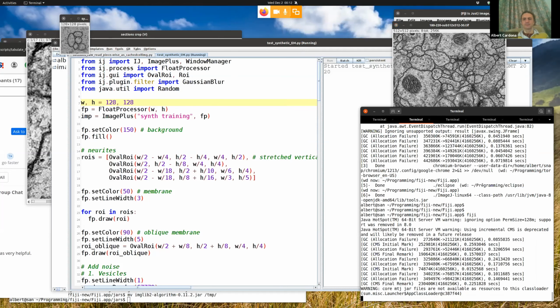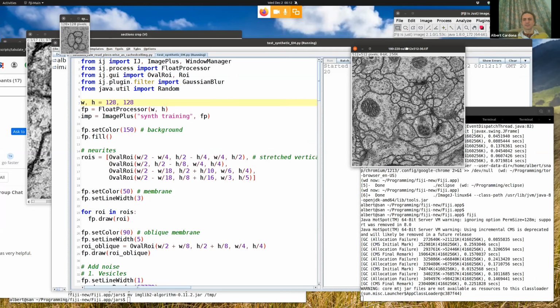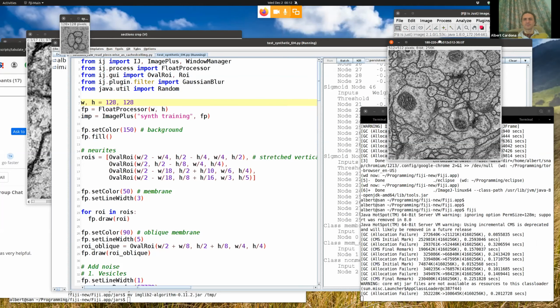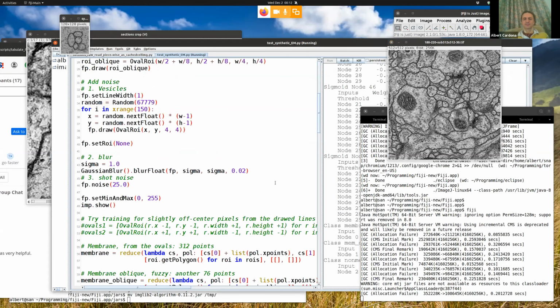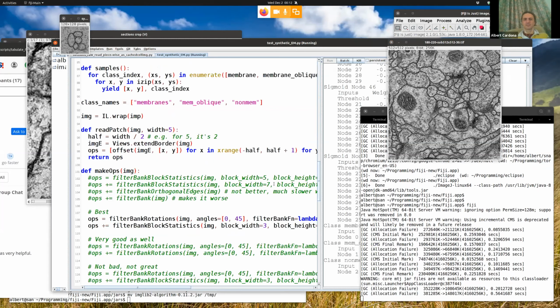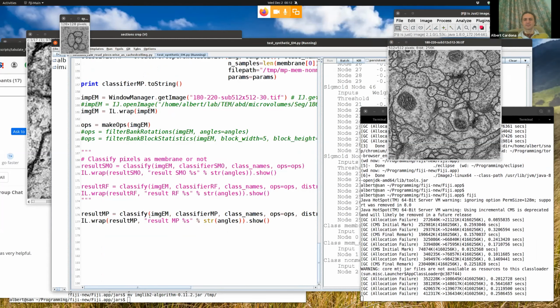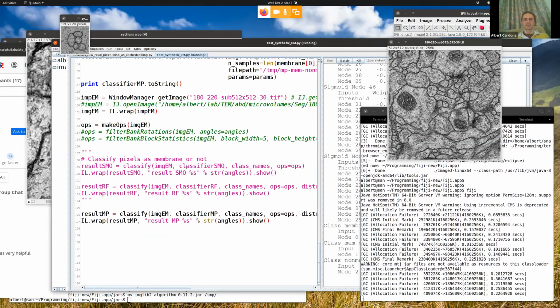Wow, it's taking its time. I guess the very first time, the wiki takes a long time. Will it show me the images, please? Still running. Now it's probably classifying the image. Come on, that takes too long.